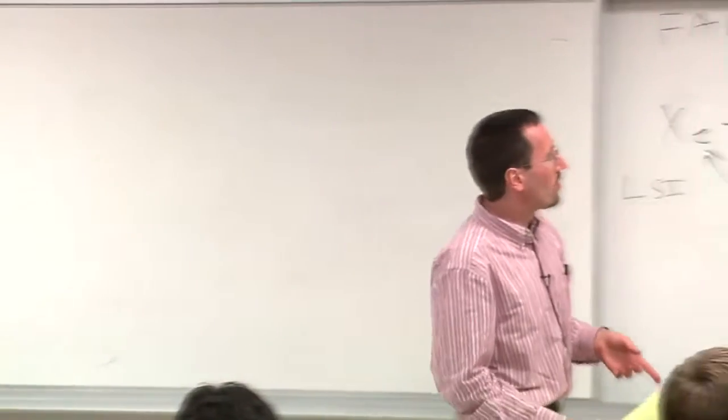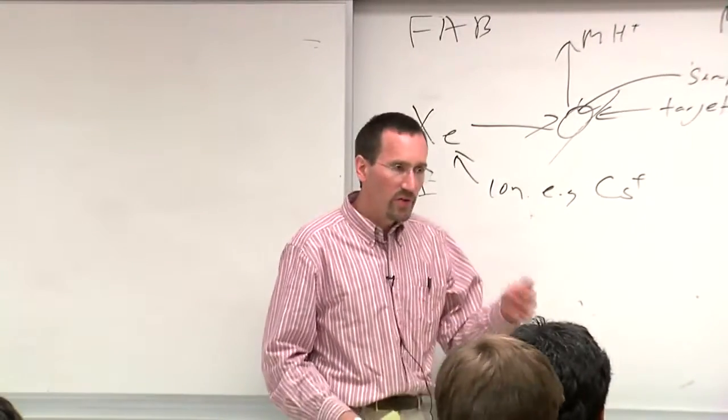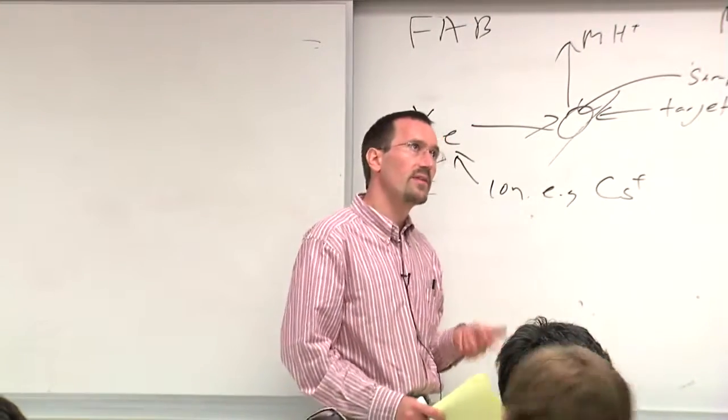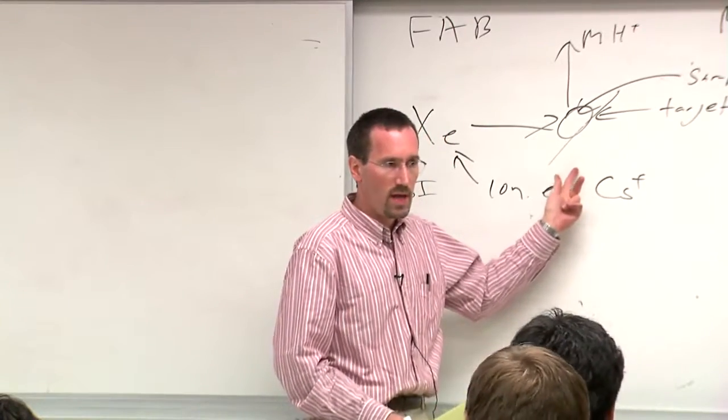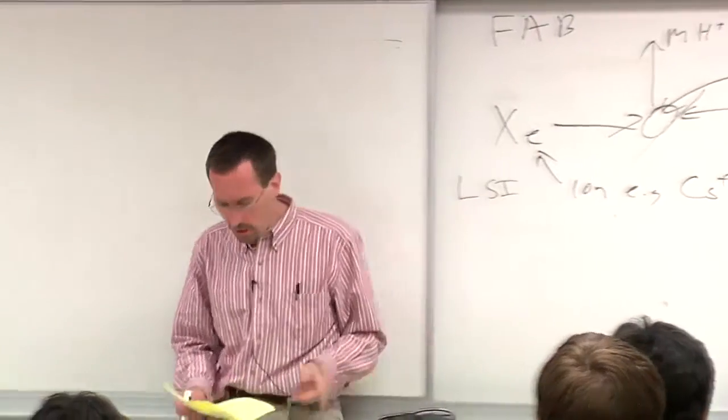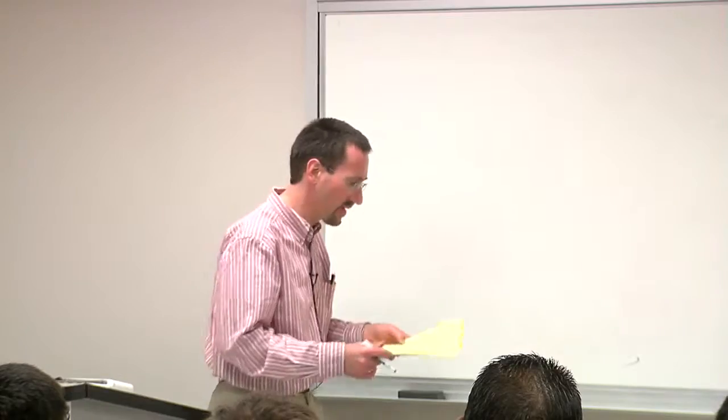It does. You can go with stronger magnetic fields, or I think typically this is done with a quadrupole. And then for MALDI, which I'll tell you about in a second, often people do time of flight because time of flight tolerates even bigger mass range.